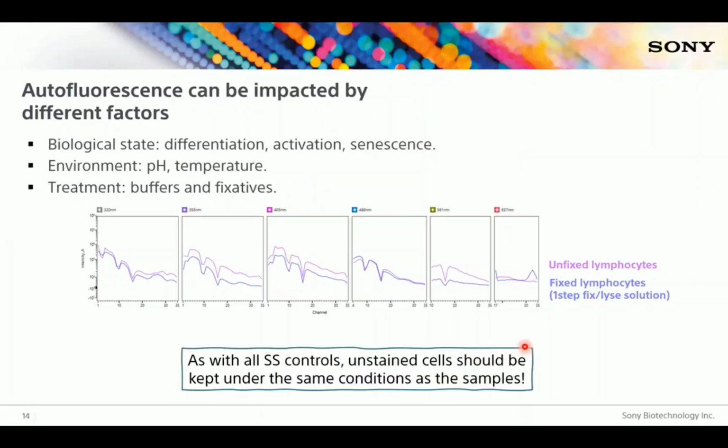For that reason, as with all single-stain controls, unstained cells should be kept under the same conditions as the sample. Again, best practice, prepare the unstained control at the same time, under the same conditions as all the other samples and single-stain controls.